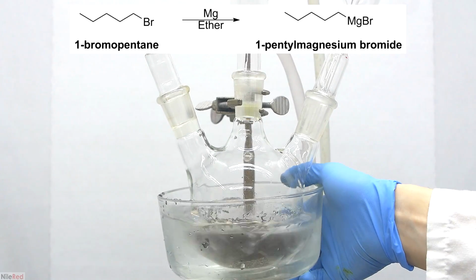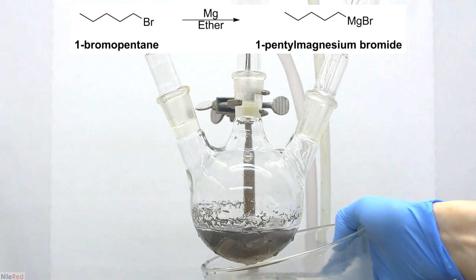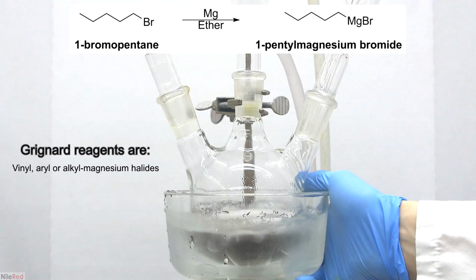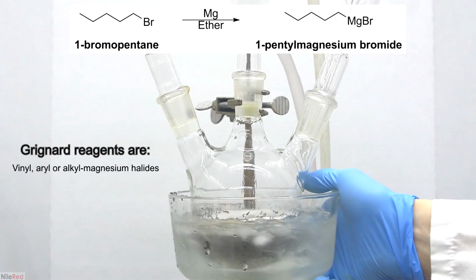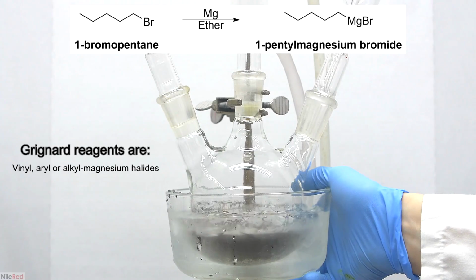Anyway, in this reaction here, what we're doing is preparing the Grignard reagent. Schematically, it's a pretty simple reaction where the 1-bromopentane reacts directly with magnesium to form 1-pentyl magnesium bromide. This organomagnesium halide is generally known as a Grignard reagent.